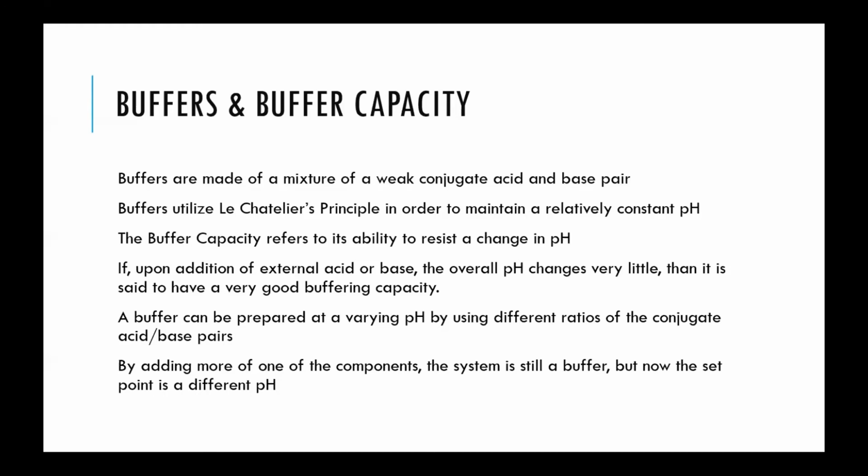In the case of something like water, it is not a buffer at all. If you were to measure the pH of water, like you will do in the virtual lab, and then add just even the tiniest amount of acid or tiniest amount of base, the pH changes by a large amount. It has no buffering capacity, but a buffer will be able to resist that pH change and hold its pH relatively constant. Now, it will change ever so slightly because you're adding an acid or base, but when you're looking at buffering capacity, you're looking at these in relative terms.